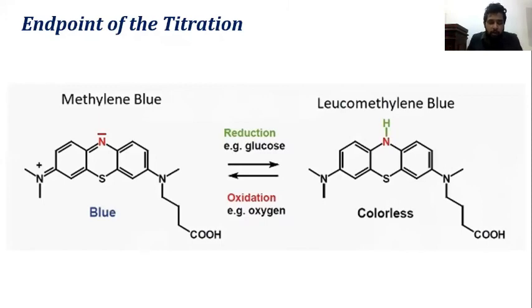Yes, I totally got your idea. The thing is, even though we add 1 drop of sugar, the redox reaction can happen. Redox reaction means glucose can oxidize into gluconic acid, and Cu2+ will reduce into Cu+, and it will not remain as Cu+. Due to the presence of hydroxyl ions, it will form Cu+ hydroxide, and in the heated condition it will convert into Cu2O, that is cuprous oxide. That is the brick-red precipitate.